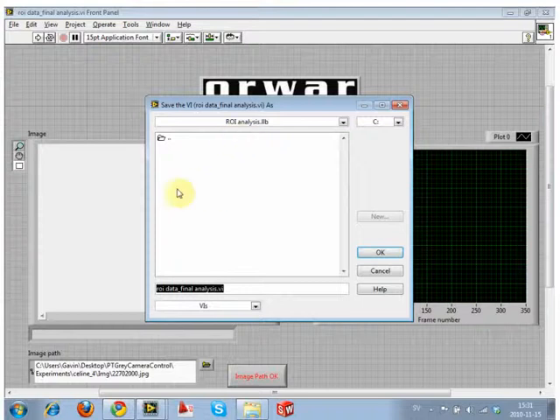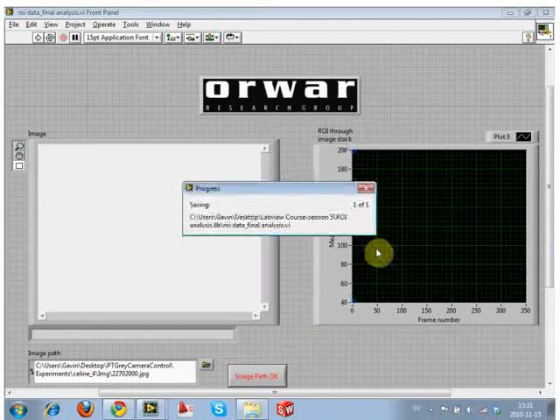And then it's kind of saying, look, it's going to go in this one, is that okay? We can then change the file name within this LLB file if we want to, but we can keep the same file name.